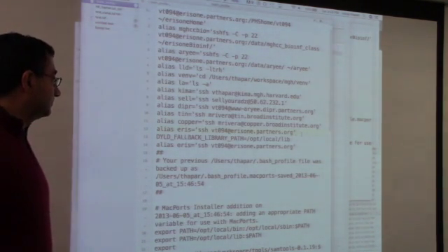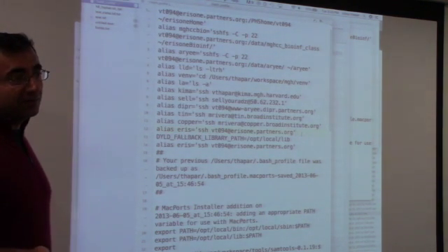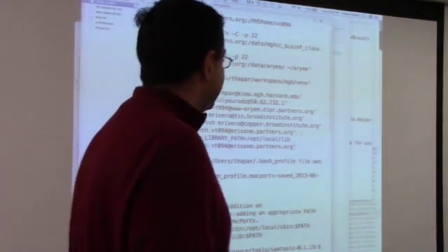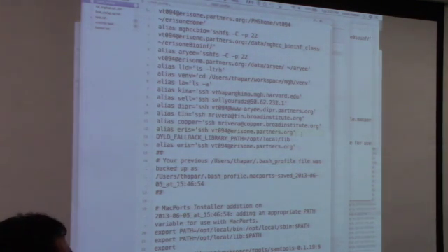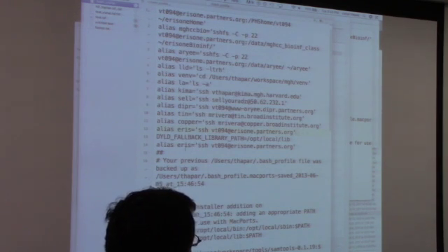So you can add it anywhere in the bash profile? If it's a new file, you'll only add it in the first line. Or wherever it is, yes, you can add it anywhere. And you could theoretically call it anything you want. Yes. It's dangerous. You could call it Voldemort, or you can even call it Snowflake or Penguin. Whatever name you type here, that's what it'll be. And if you just redo it, then it overwrites it.